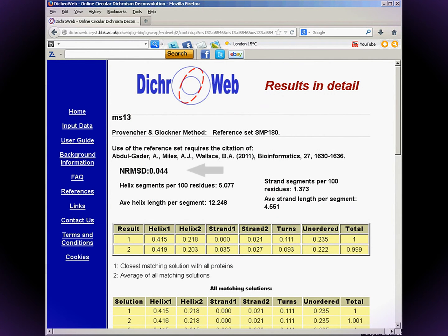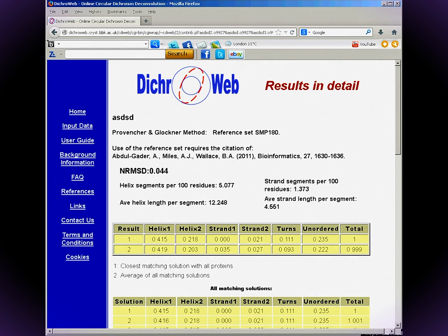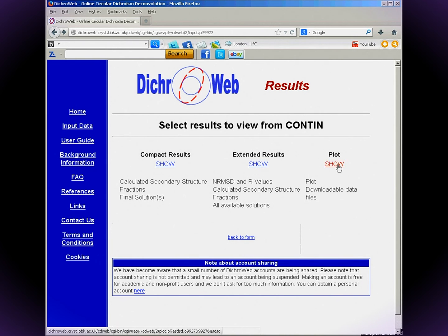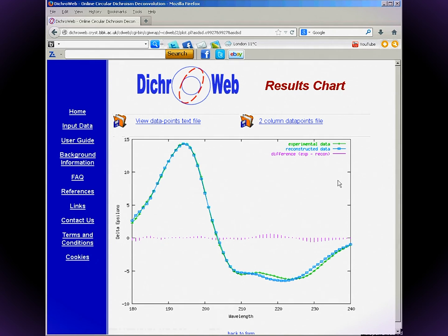The NRMSD quantifies the goodness of fit between your spectrum and a back-calculated spectrum, and is therefore an indication of how reliable the secondary structure prediction is. If you go to Plot, you can see the back-calculated spectrum and a graphical display of the residuals.